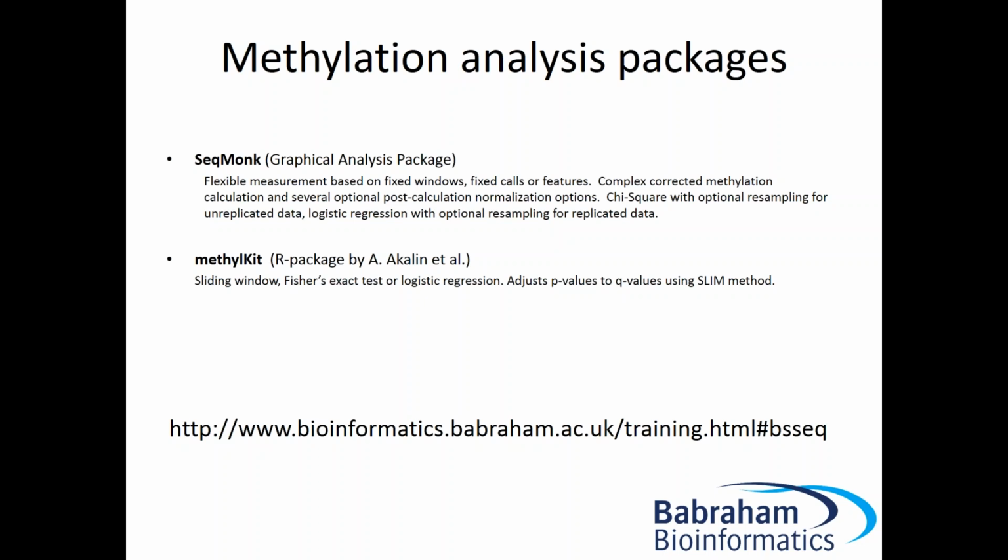If you want to do a larger scale analysis and you need an automated way of doing it, a lot of the same methods that we have in here are implemented in the methylKit package, which is an R package. It has a number of different things that you can do, but the same statistics are there. You'll need to construct your own visualization on top of that, or take hits out and bring those back into more of an interactive package to view them. But both of those are useful tools to look at.